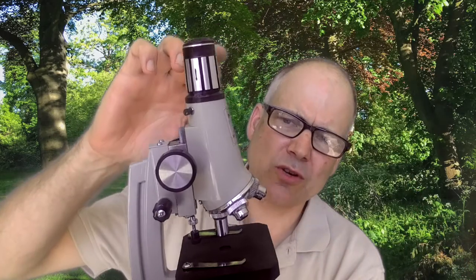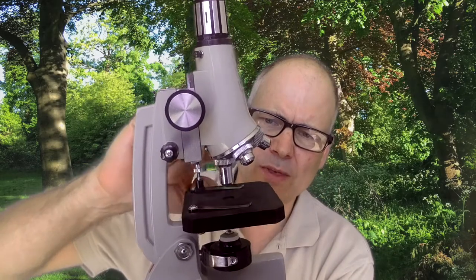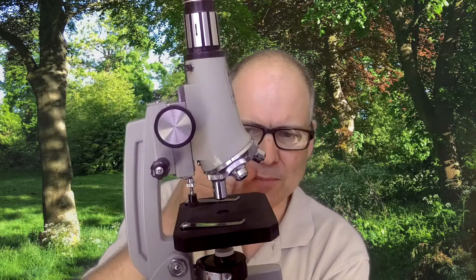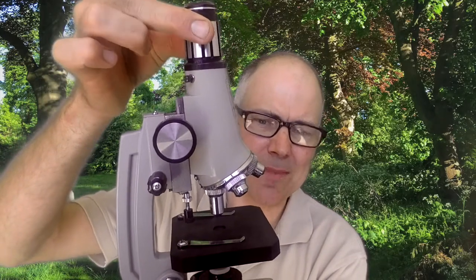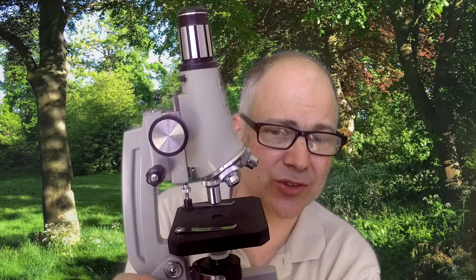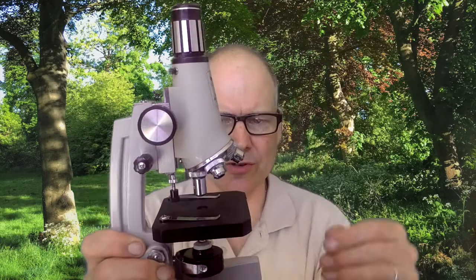But that means that what you can do is multiply times 10 at the top, when it's on the 10 setting, with the objective lens magnification at the bottom. And when it zooms up to times 20, the maximum magnification that this light microscope can achieve on paper is 60 times 20, so 1,200 times. That's really pushing the limit, actually. 1,000 times is pretty high for a light microscope.